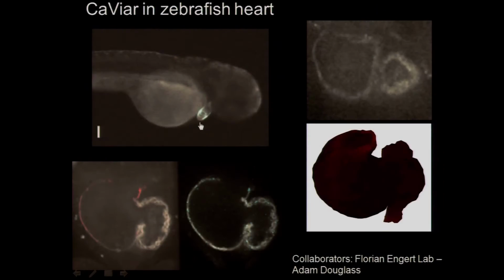We're also interested in looking in live animals. We've made a zebrafish, which expresses this calcium and voltage indicator in its heart. So now we have Caviar in fish. Here's an image of the calcium signal in the heart of this fish. So you can just take the whole fish and plunk it down on the microscope, and you can see the calcium signal in its heart.